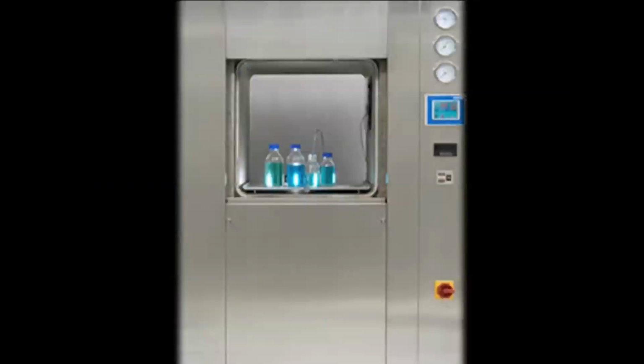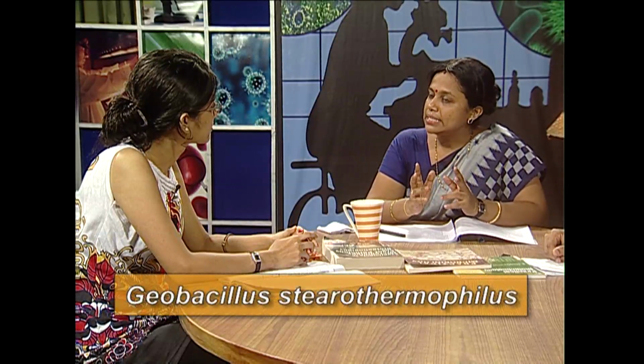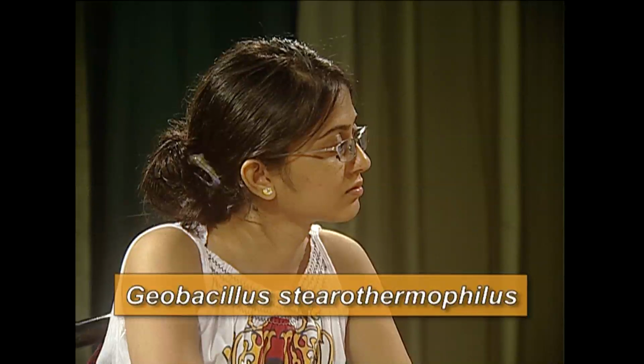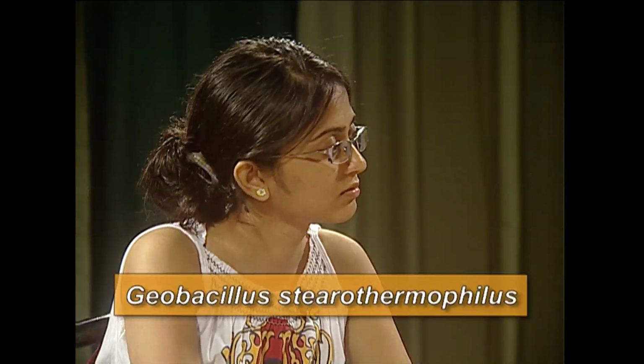That's why we have started using certain biological indicators. These biological indicators are the spores of Geobacillus stearothermophilus, which are very resistant towards heat killing. So if these spores are destroyed during autoclaving, then we can say with immense surety that the process of sterilization has been carried out perfectly.